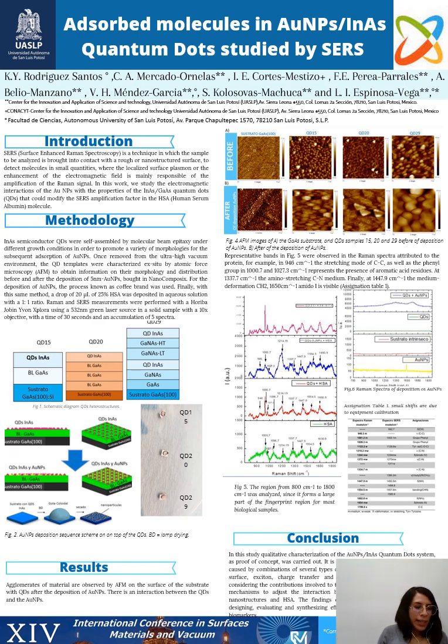In picture 1, we have a schematic diagram of the quantum dot structures. In picture 2, we can see a description of the process of the deposition of the gold nanoparticles. In the picture on the right, we can see the samples with the gold nanoparticles in solution.